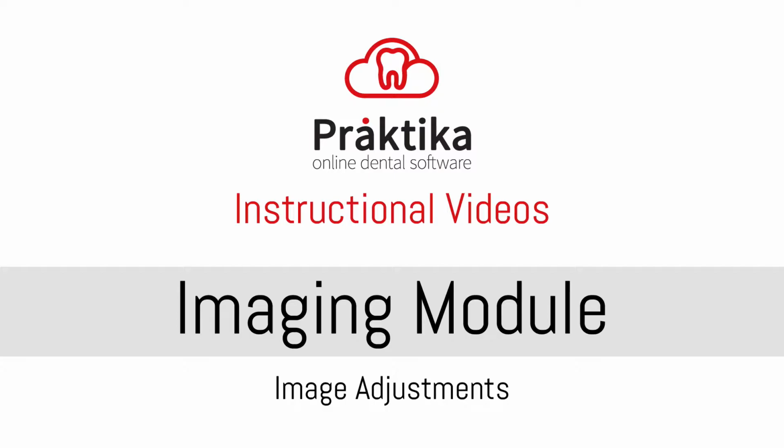Hello. This video will cover the image adjustments in Praktika's imaging module. Please note that the image adjustments are set per each individual image. They do not affect settings of other images. The adjustments do not change the original image. Instead, they apply image adjustments, transformations and annotations as separate layers that can be activated or deactivated.